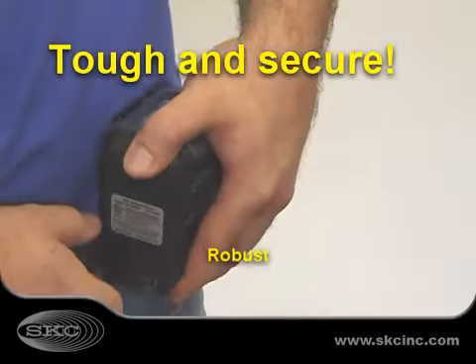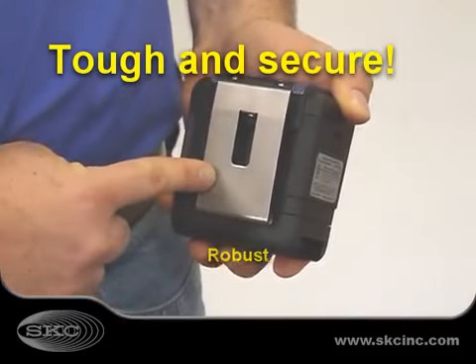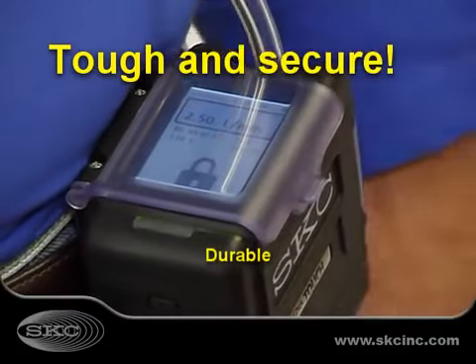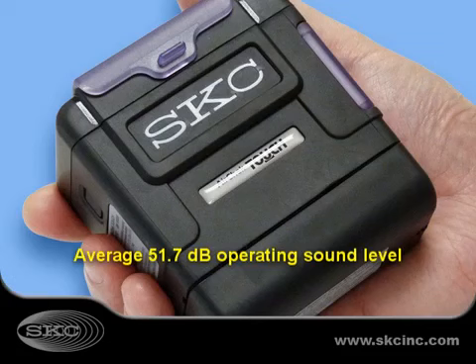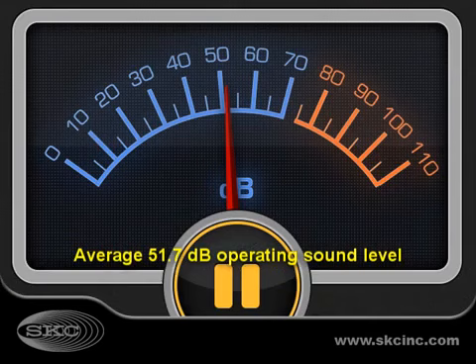TUF Secure AirCheck Touch features a large secure belt clip, protective screen cover, screen lockout features to prevent changes to pump settings, and a unique noise-dampening case for unbelievably quiet operation.